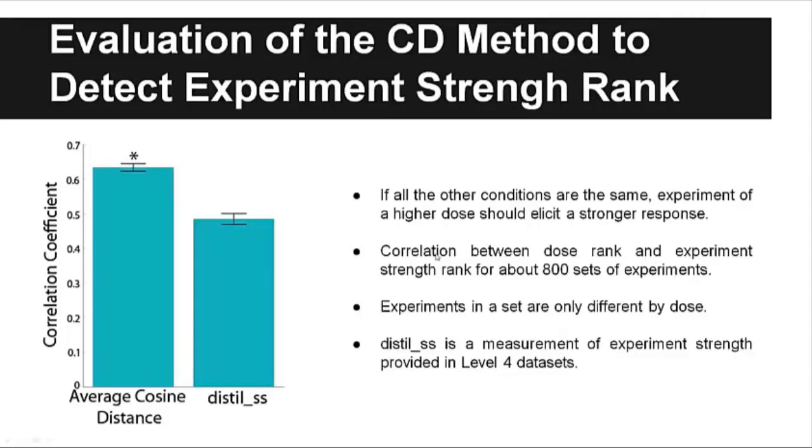So I correlated the experiment rank by dose with the experiment strength rank for about 800 sets of experiments, and the experiments in a set differ only by dose.